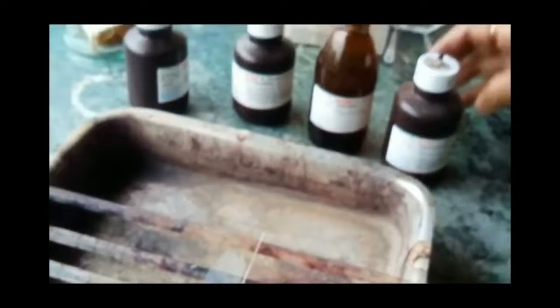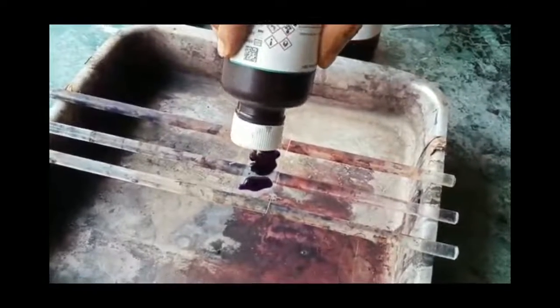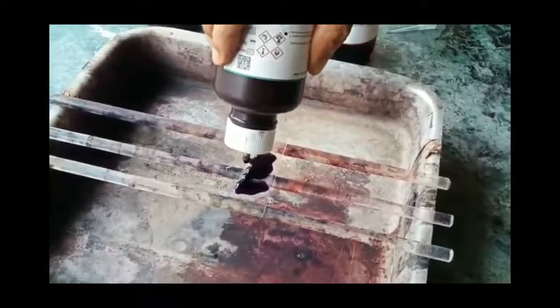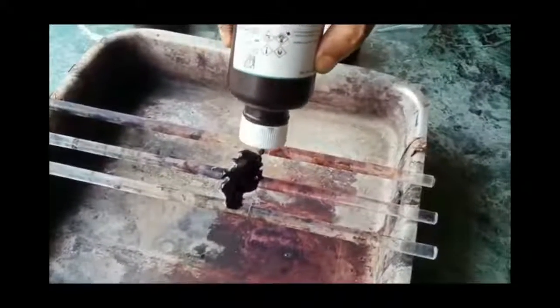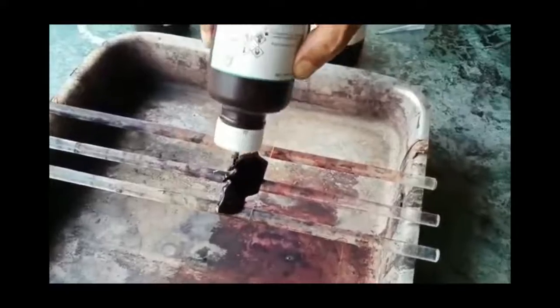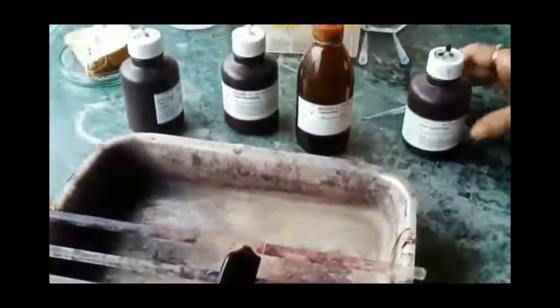So first of all, we will cover the smear with crystal violet, which is the primary stain. The entire smear is covered with the crystal violet stain, and then it is allowed to stay for 30 seconds.